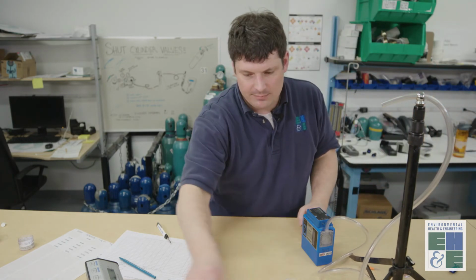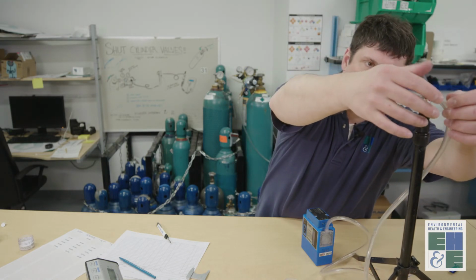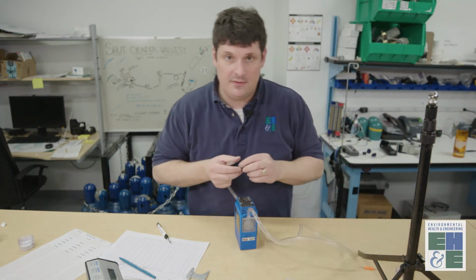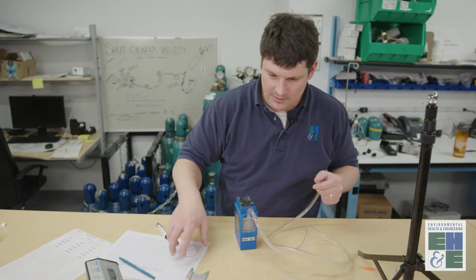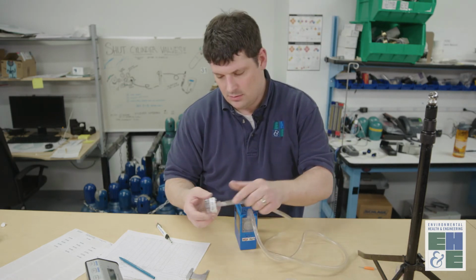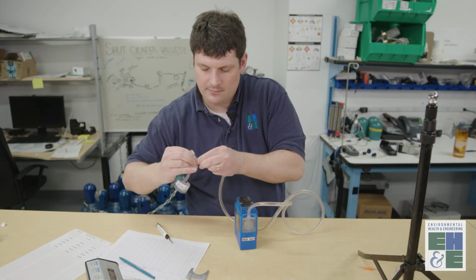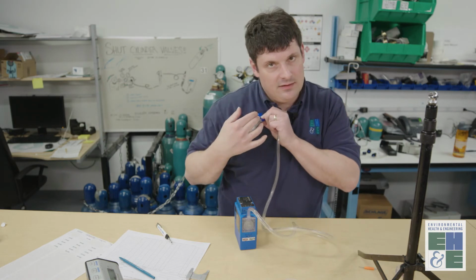We can also collect personal samples with these kinds of pumps, in which case you don't need the tripod, obviously. We're going to attach the pump in the breathing zone of the worker that we're sampling. We can do that with a two-piece cassette, for example, with a lower adapter, using a device like this, which we connect here, making sure that we're not going to crimp the tubing, and then we attach it in the breathing zone of the employee.